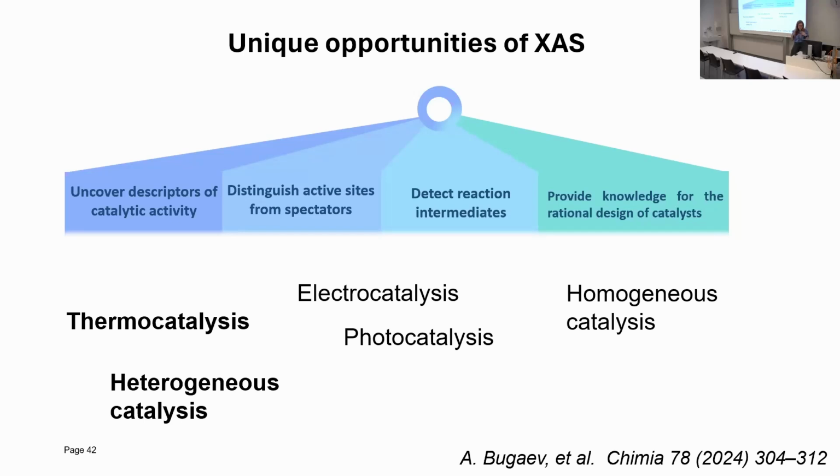Another thing is that my talk was mainly focused on thermal and heterogeneous catalysis, but the technique is not limited to it. We also have cells and ongoing research on electrocatalysis, photocatalysis, and homogeneous catalysis.